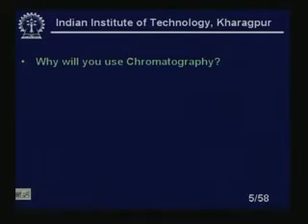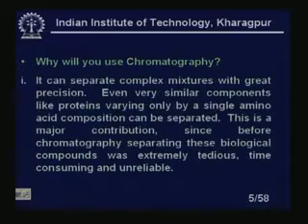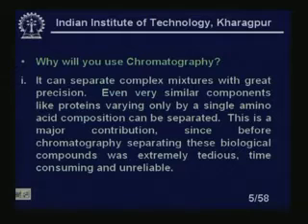Why do we use chromatography? Why do you need gas chromatography or chromatography in general? It can separate complex mixtures with great precision. This is the most important thing. I have two or three gases in a particular mixture and I want to know them precisely, which means first of all you have to separate them. If you cannot separate precisely, you cannot measure the contents of the individual gases. So the precision in separation is very important in the case of gas chromatography. That is the reason I am saying it can separate complex mixtures with great precision.